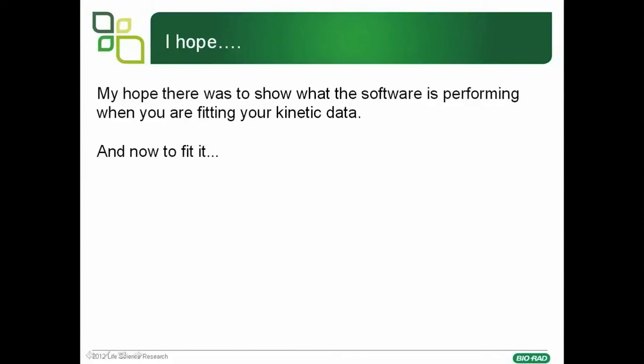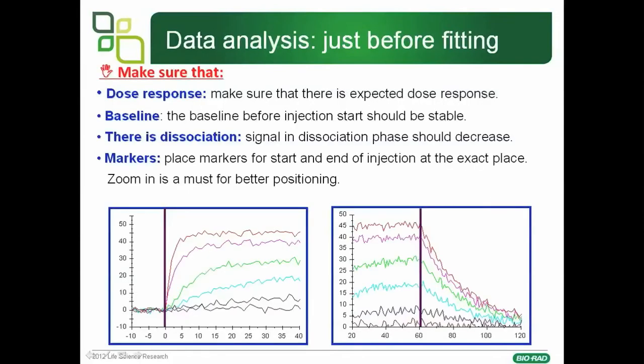Just before fitting, you need to make sure that there is a dose response — the highest concentration gives the highest response, and as concentration is reduced, the response is reduced. You need to make sure that the baseline is stable before the start of the injection, as in the left-hand example. You also need to make sure that there is dissociation. For systems where the dissociation rate constant is 10⁻⁴ or 10⁻⁵, this can take minutes or in some cases hours. Sometimes you need to zoom in on the data to correctly mark the start of the dissociation.